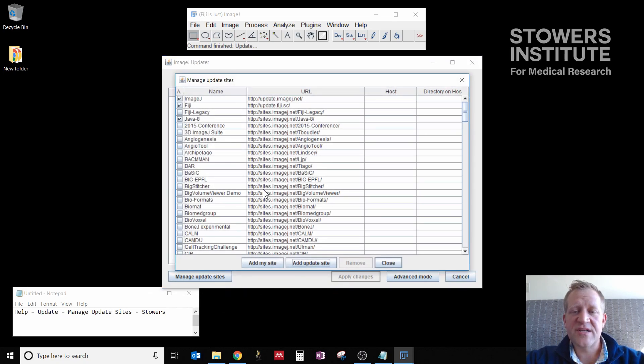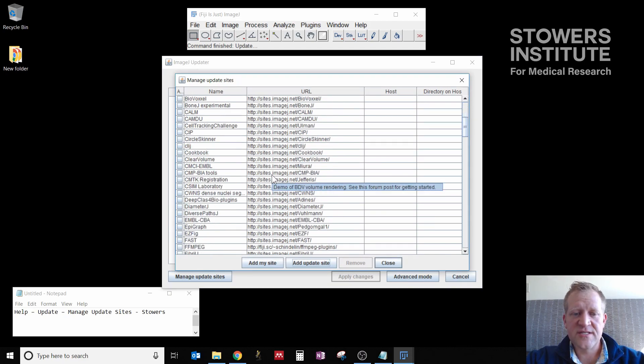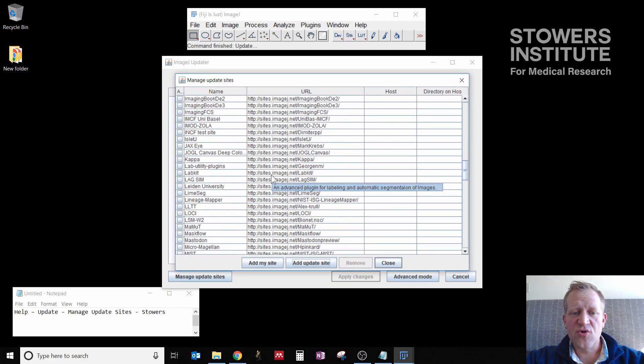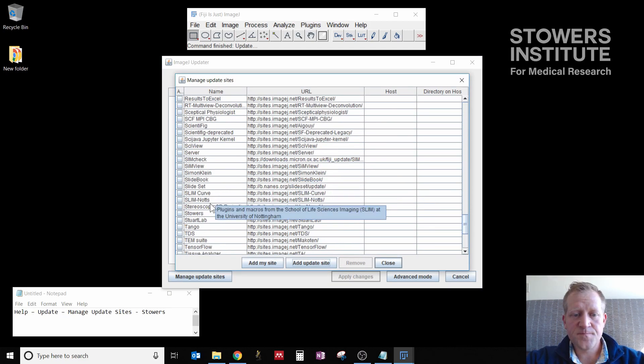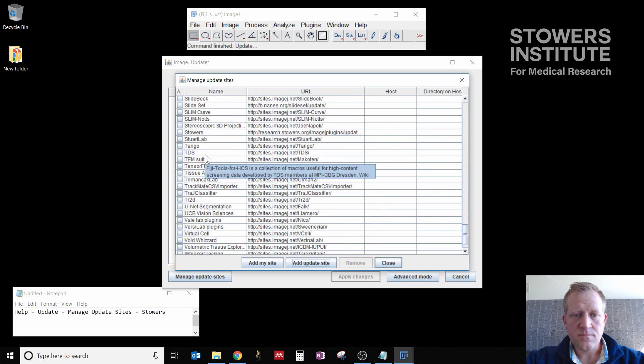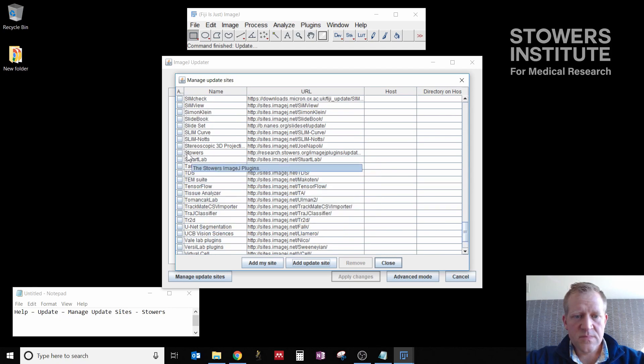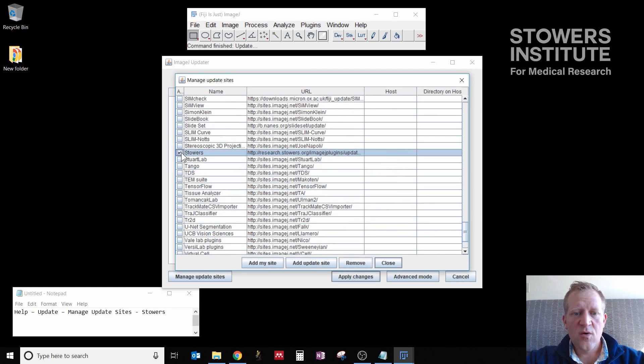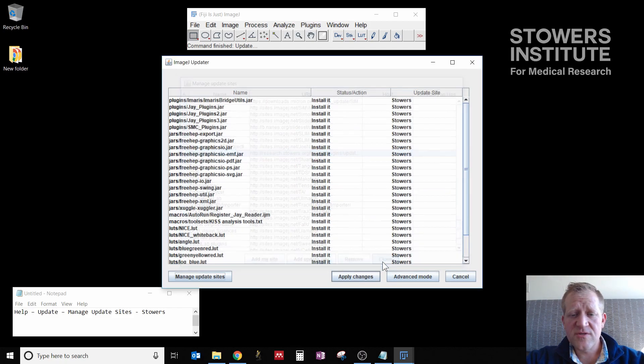I'm going to click Manage Update Sites. And this brings up a list of all possible host locations. I'm going to scroll down to Stowers, which is right there.